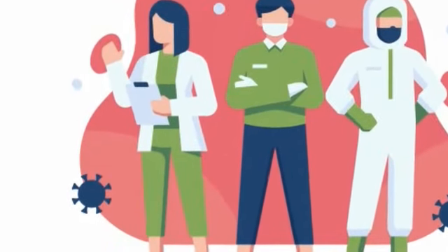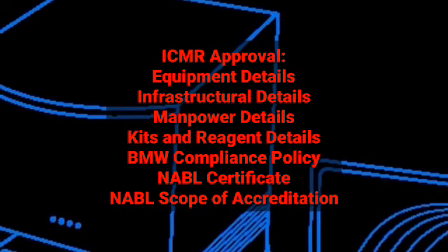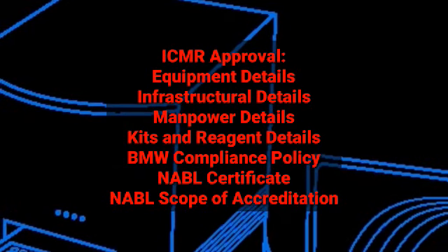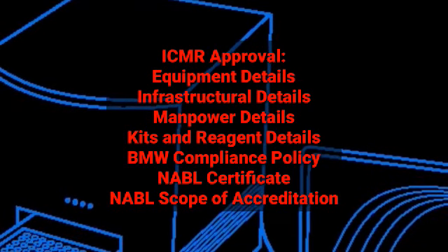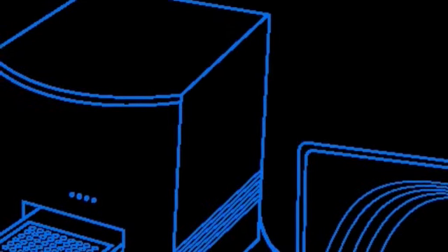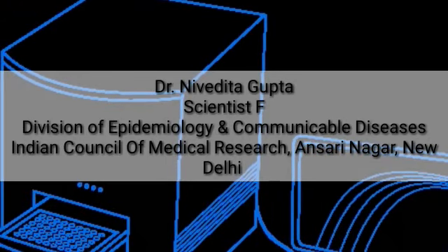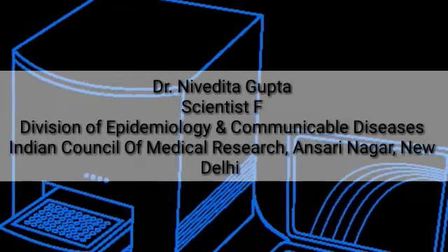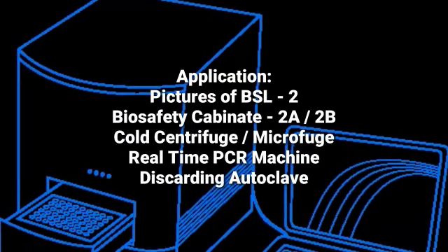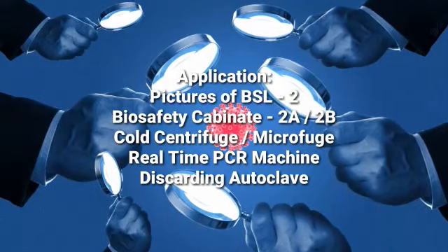COVID-19 testing can use the same application format and can apply to the NABL ICMR for approval of COVID-19 testing facility. This document mentions all the details that need to be submitted to ICMR for getting approval. The laboratory can send the details of equipment, infrastructure, manpower, reagents or kits for COVID-19 testing, and biomedical waste compliance policy along with their NABL certificate and NABL scope of accreditation, which must include real-time PCR for RNA virus. The details can be mailed directly to Dr. Nivedita Gupta, Scientist F, Division of Epidemiology and Communicable Diseases, Indian Council of Medical Research, Ansari Nagar, New Delhi.